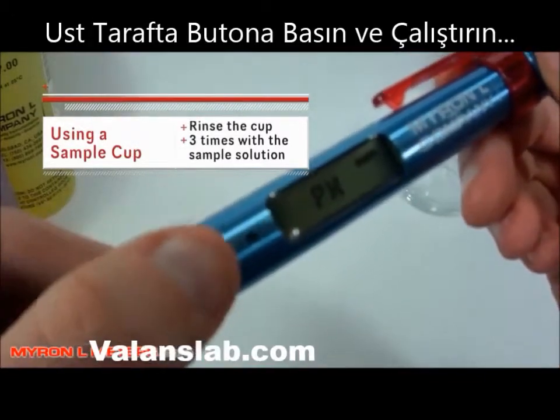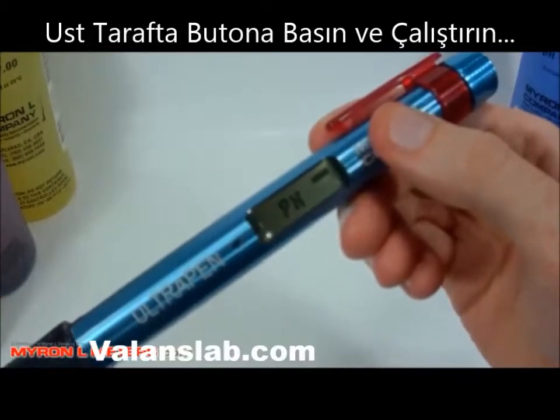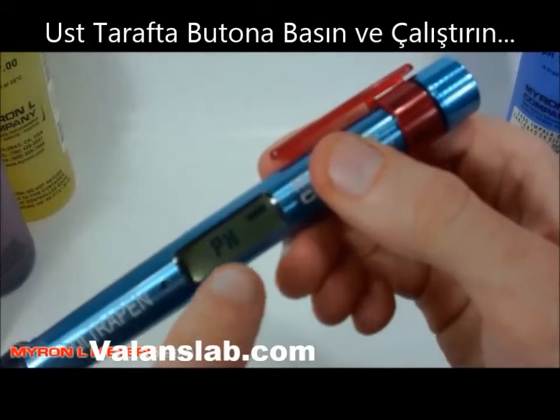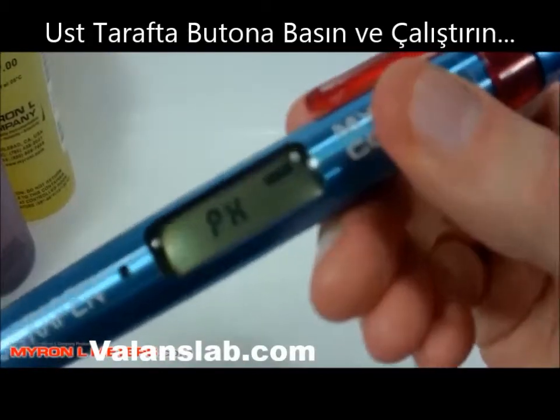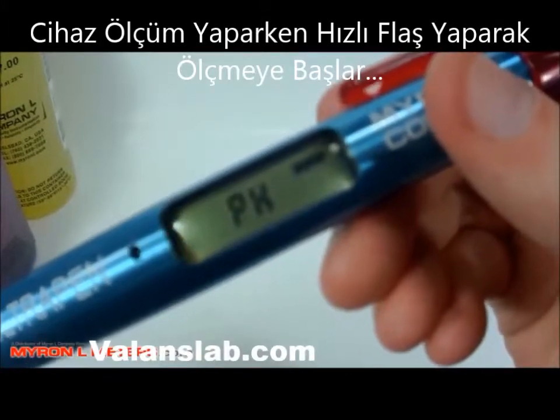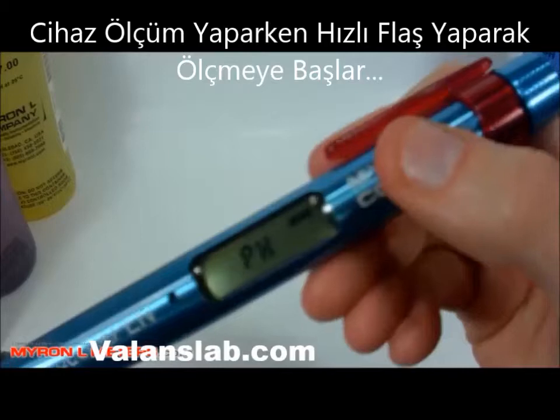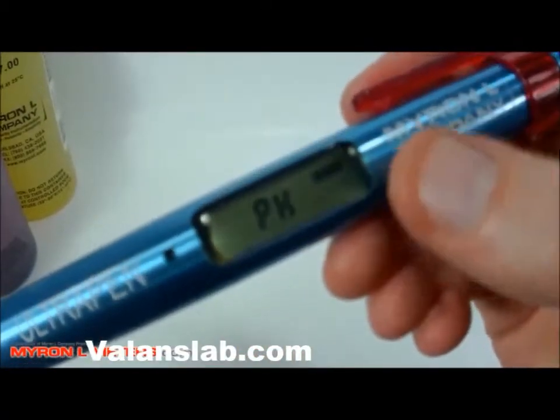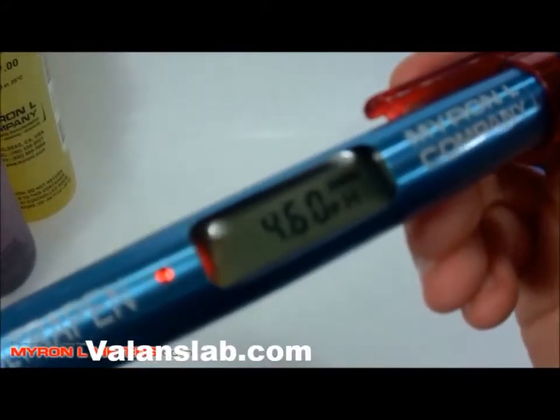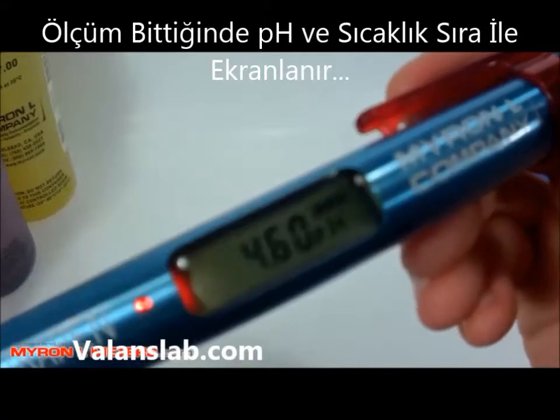The slow blinking light tells you that the measurement is actually stabilizing, and as soon as the red blinking light is solid, the measurement will be displayed in the display. I will give this a minute to stabilize. It's got the storage solution in the cap here, so we're expecting around four and a half pH roughly. We've got 4.6 pH with a temperature of 25.5 degrees Celsius.